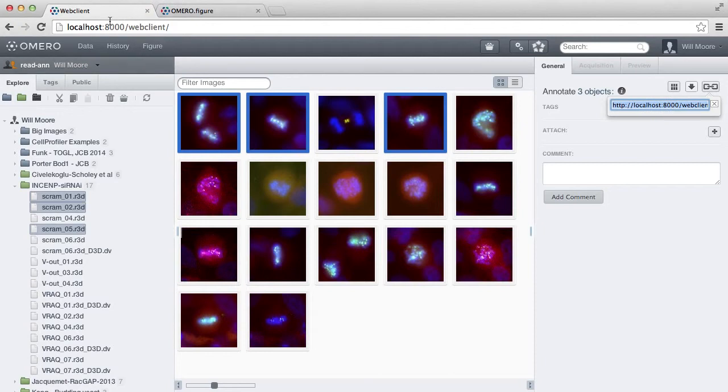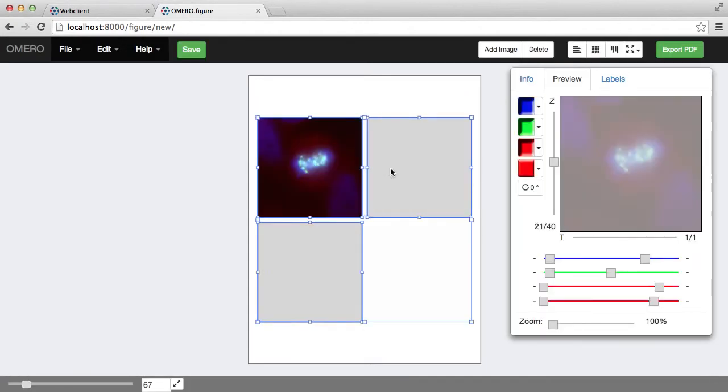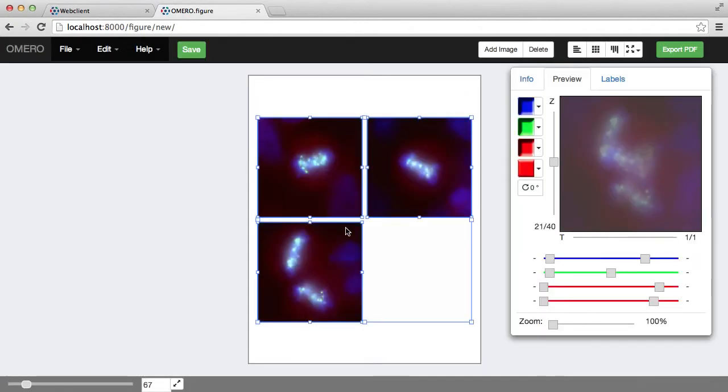So if I copy that and go back into Figure and paste that in here, this will bring those images into the figure.